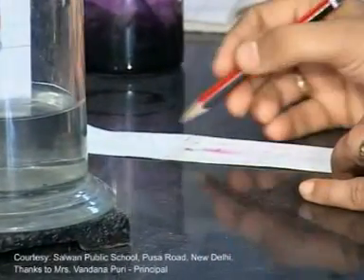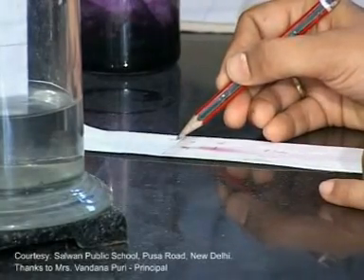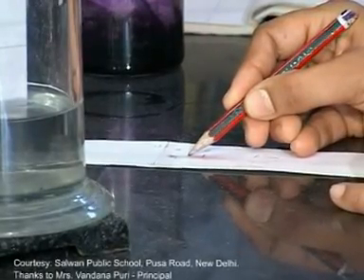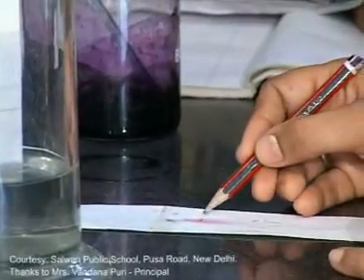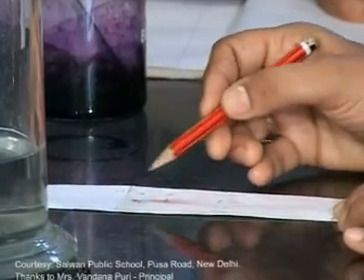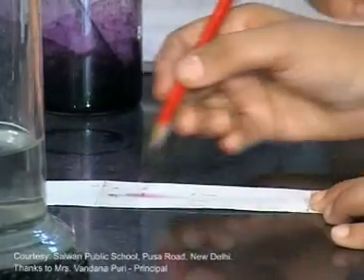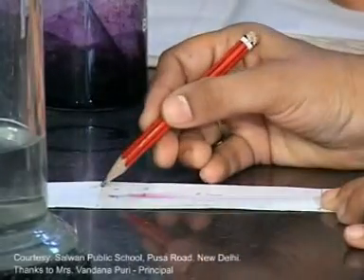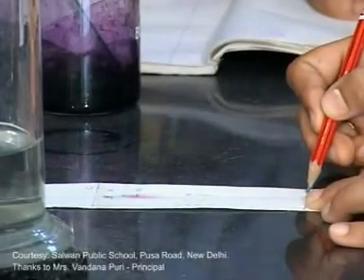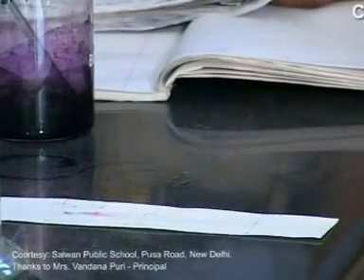This is the solvent front. Let's call it C and mark the level of the red ink from its center — let's mark it as A. Similarly, mark the level of the blue ink from its center — let's mark it as B. Now measure the heights of the solvent front, blue ink, and red ink from the baseline, which is called the origin line.